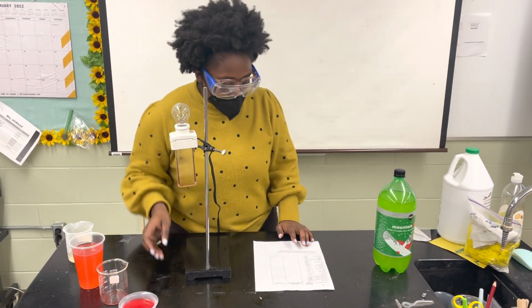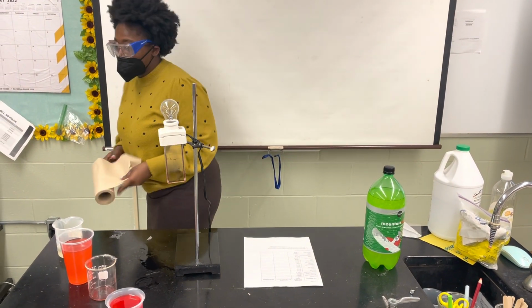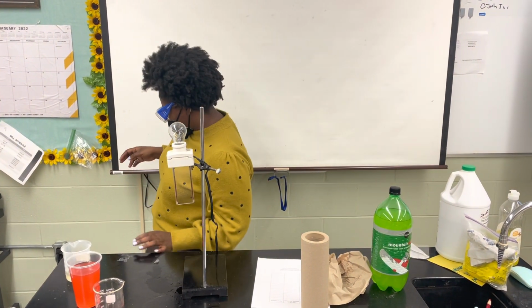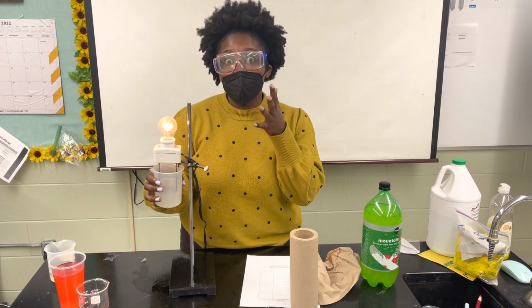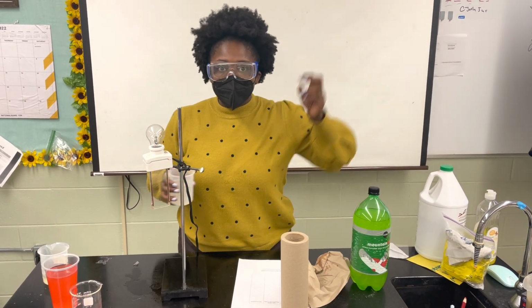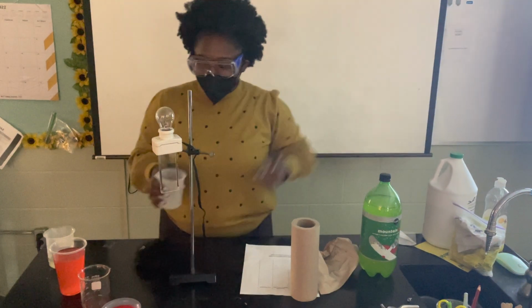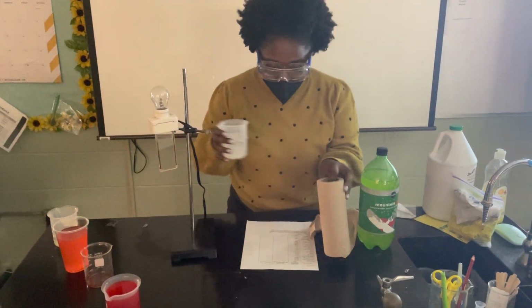The next one on the list is Alka-Seltzer in water. But first, we're going to clean off our probe. Notice I turned it off so that I don't shock myself. Again. All right, here we go. Alka-Seltzer in water. Thank you, magic helper. Whoa! It's lit. You know what this would be cooler with? If the lights were off. Ding! Whoa! It's lit! That was Alka-Seltzer in water.